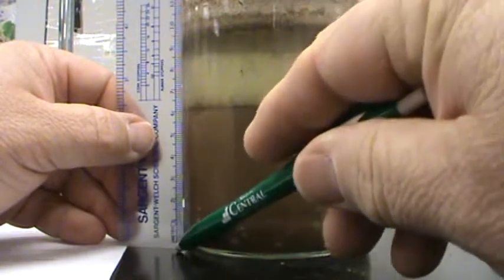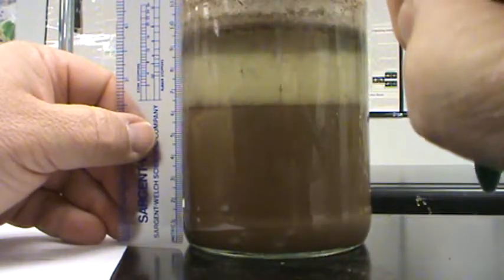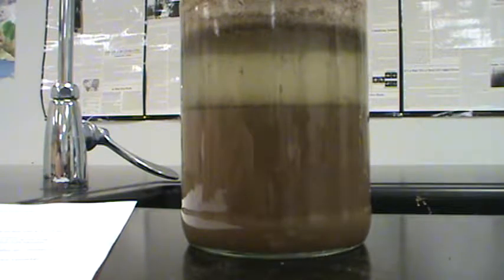So we start here at the bottom. 1, 2, 3, 4, 5, 6. 6 is even right there with the top. So our sample did not change after 24 hours like some have. Are there any layers? Yes, I see 3 layers if I look closely enough.